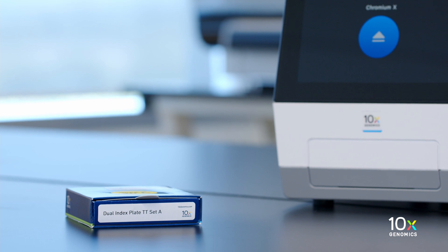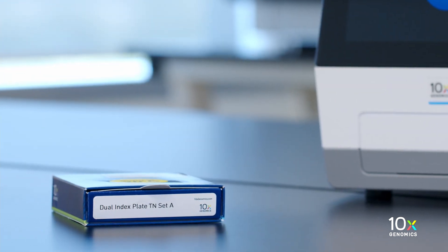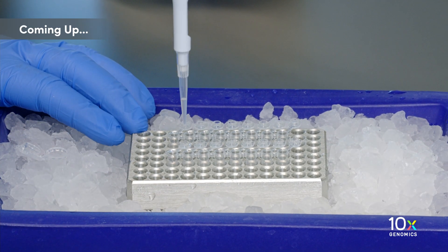Finally, we have the Dual Index Plate TT Set A and the Dual Index Plate TN Set A. We have all of our reagent kits ready. Next, we are going to prepare the MasterMix.